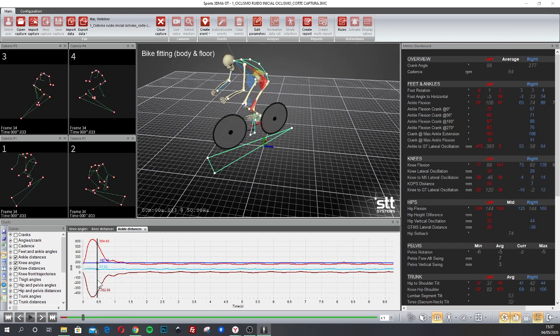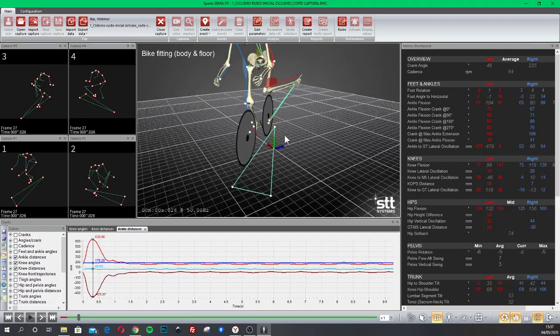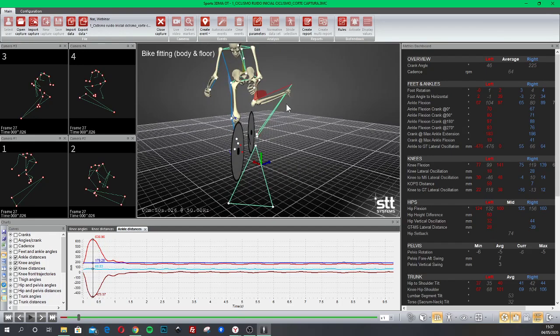Okay, so we don't want to have this corrupted or distorted part on the numerics and not on the final report, of course. So there are two things that we can do.